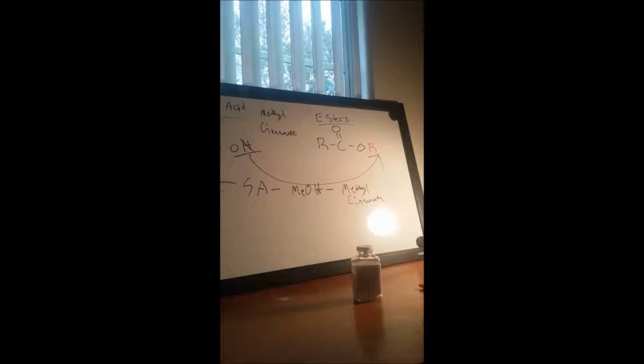Now, the conversion from acetylsalicylic acid to salicylic acid is not the first step in most synthesis videos for this particular ester. What you do first, for most of them anyway, is perform a recrystallization of the aspirin pills to get rid of all of the gunk, the binders, and stuff inside of it.